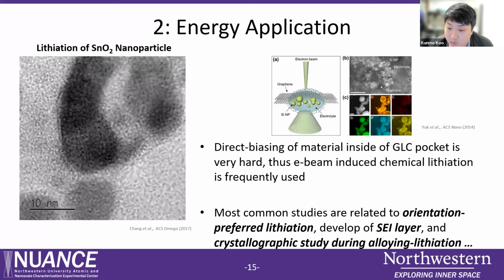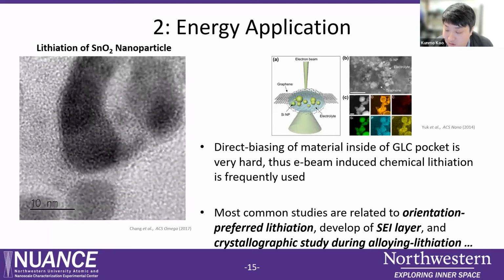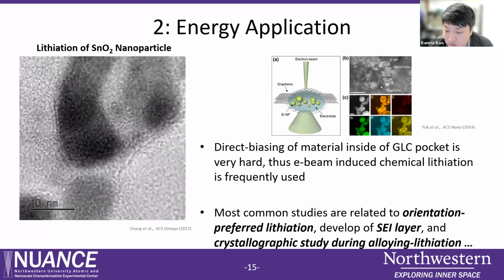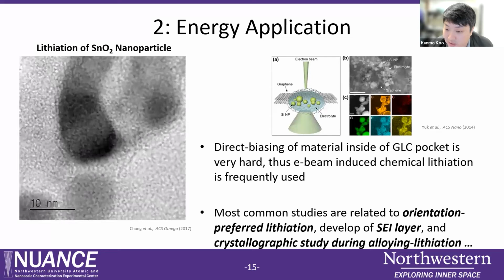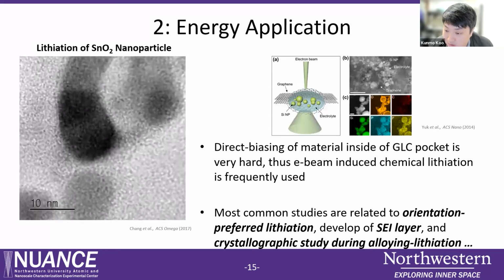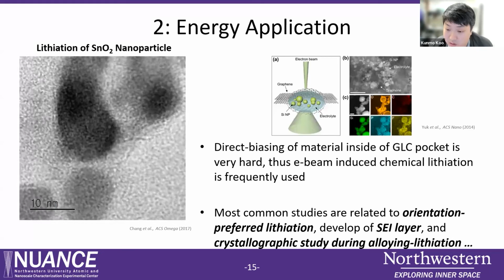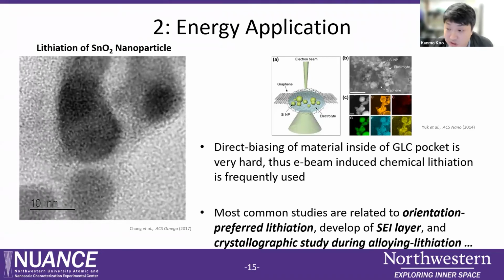mechanism. With this setup, much research has been done on the volumetric expansion and degradation, the orientational preference for the lithiation, the development of the solid electrolyte interface layer, and the crystallographic study during the alloying and dealloying stages of the charging.